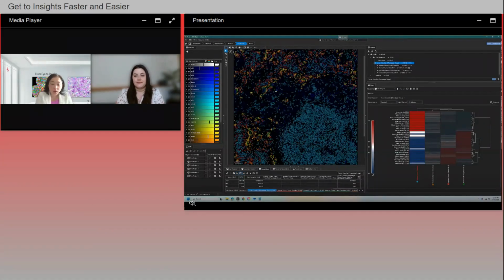Great question. So as I mentioned earlier, we have modified a very powerful generalist algorithm, the Cellpose algorithm, and we've modified this so that we can adapt it to different situations in 2D and 3D. And because we are based on Cellpose, any morphological characteristics you see in cells that are similar to the ones used in the training for Cellpose.